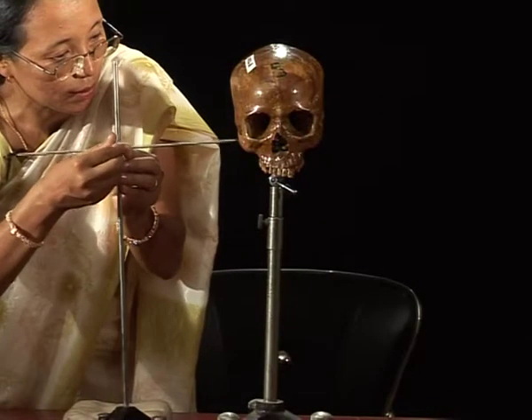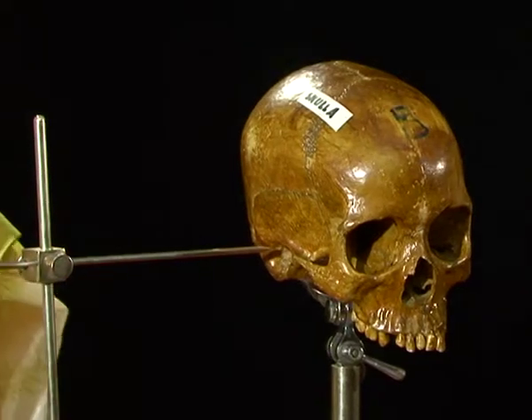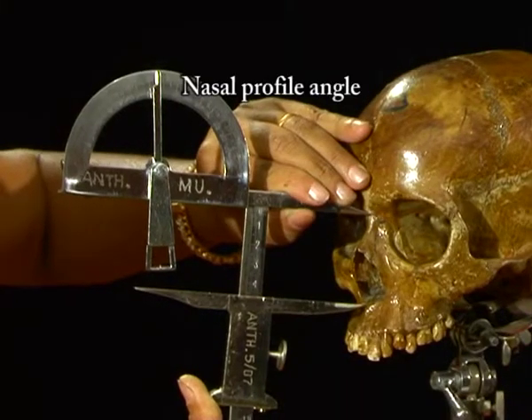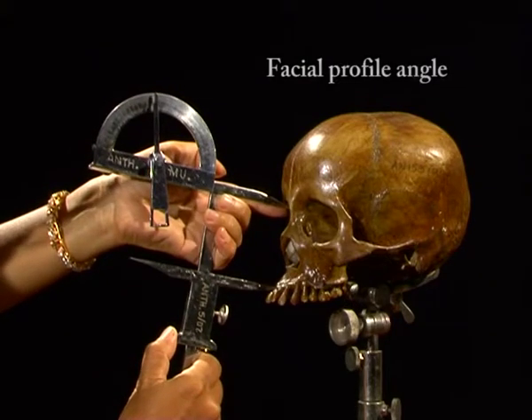Utility. It is used for orienting the skull in a desirable plane with the help of Martin's horizontal needle for taking direct angular measurements such as metopic angle, nasal profile angle, facial profile angle, etc.